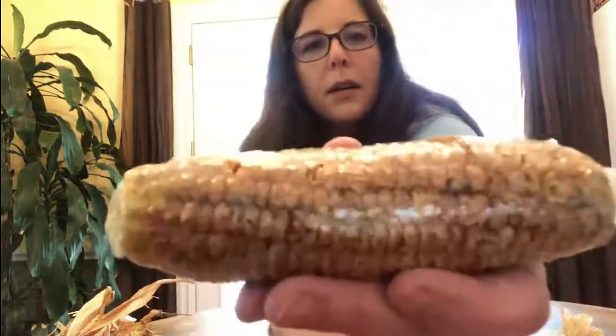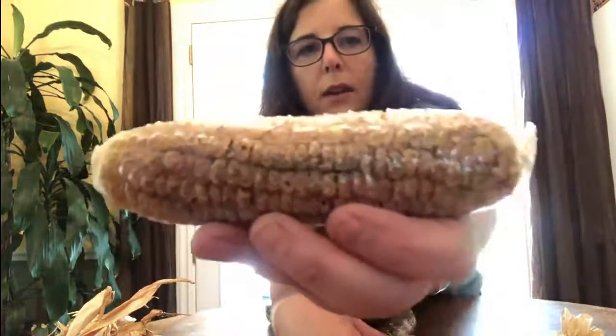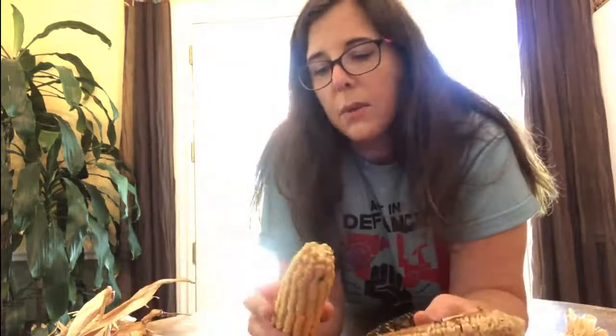All right, so one of the examples I have here is a variant that's a little bit hard to see. Hold it up. These are wrinkly, and the endosperm of the kernel is sugary. In a normal seed corn, or the corn that you would feed to cattle or other livestock, you might buy it for squirrels in your yard.